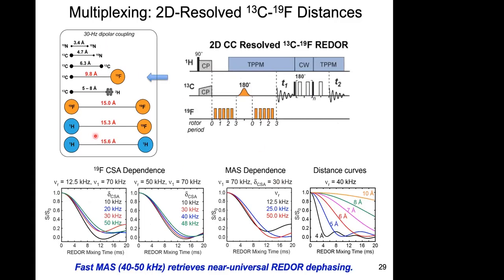Again, the ruler map, and I want to first show carbon-fluorine REDOR, the same sequence that I just showed. And here there are some details. If you caught the REDOR universal curve idea, here you see that things are not so perfect. The intensities don't decay very far down, all the way to zero. The reason for that is fluorine CSA is giving some trouble.